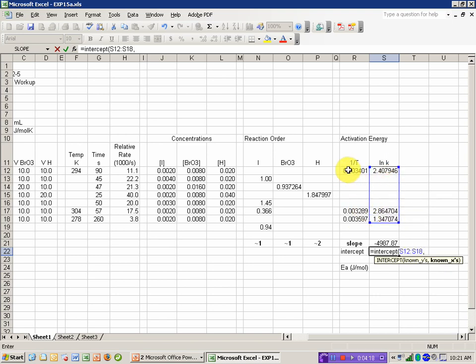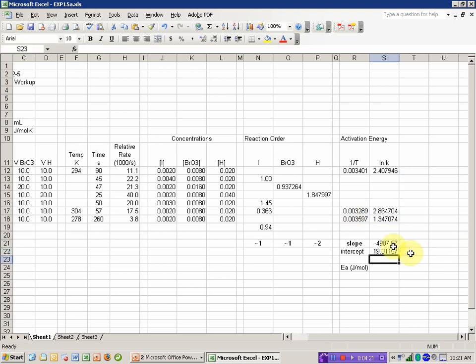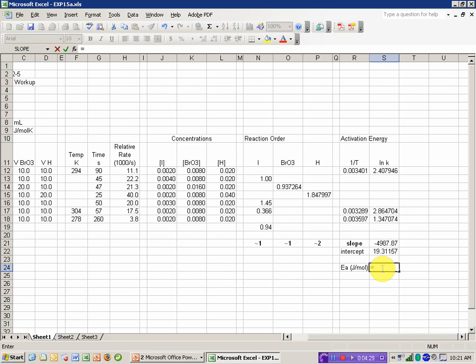Intercept. Now, I don't need the intercept for my calculation. But I want to make a plot with a fit line, and I'm going to need it for that part of the function. Now, if you recall, the activation energy, or the slope, was equal to the negative activation energy over R.